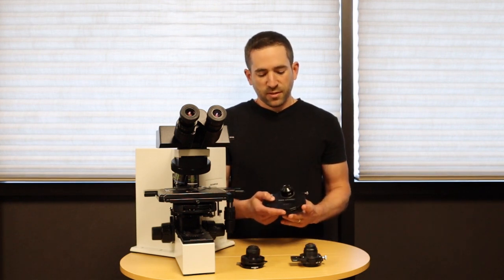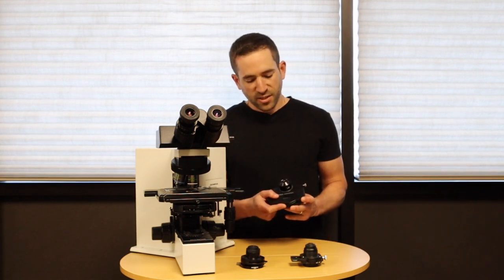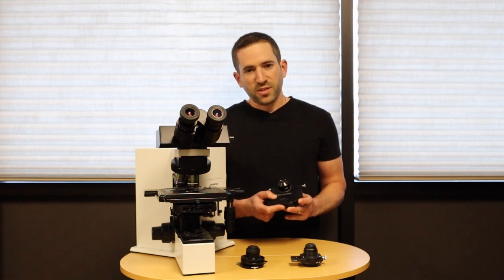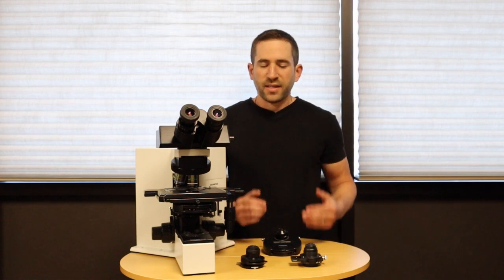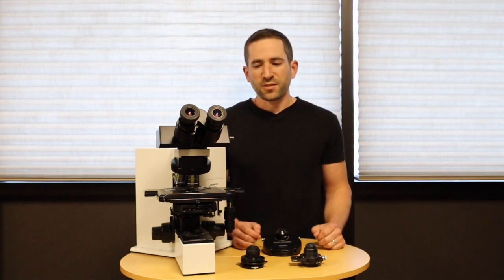As we discussed, the most convenient way is with a phase turret condenser, where it's a wheel that you simply rotate, not having to add or remove any parts from your microscope, and is an easier, more simple process.